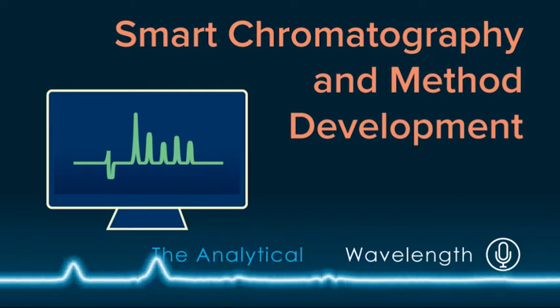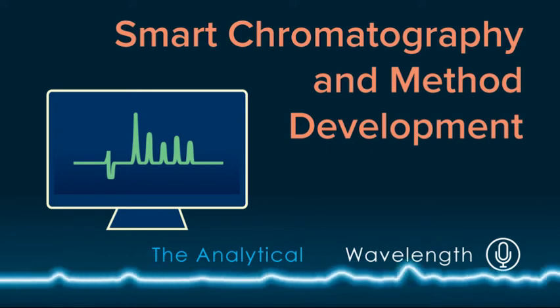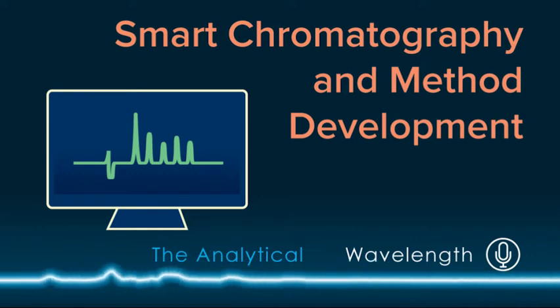The idea of a sandbox to explore analytical methods is a useful analogy for chromatography software. Now let's take things to the next level. What does it look like when the software is used in a large company? Dr. Justin Shearer is a separation scientist and team leader at GSK. Let's talk with him about how computer-assisted chromatography tools impacted his work.